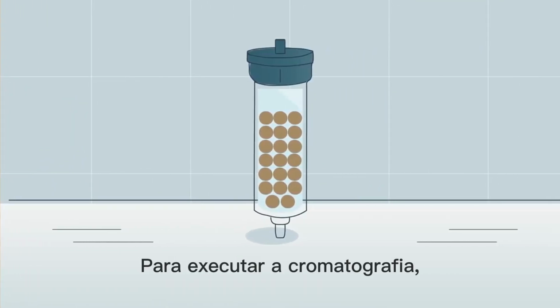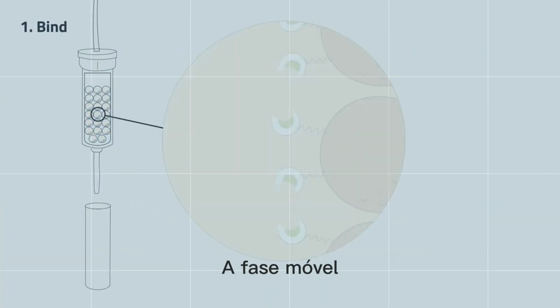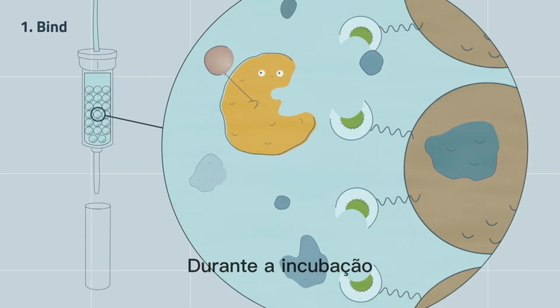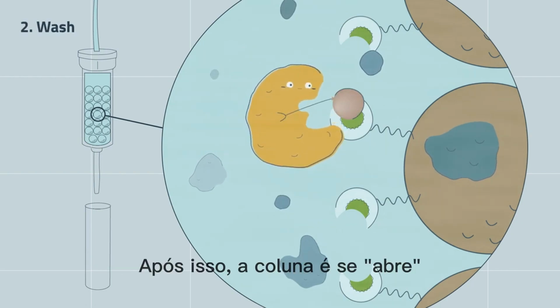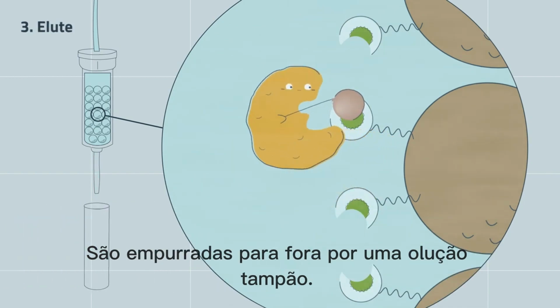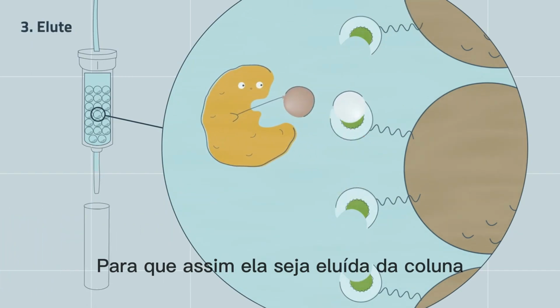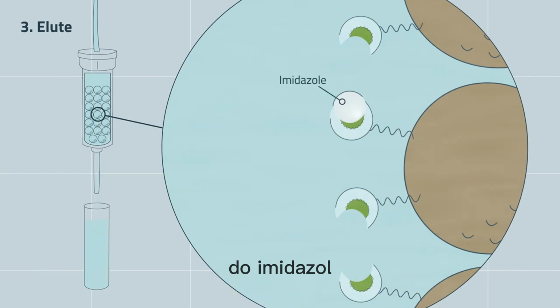To execute the chromatography, the stationary phase can be packed into a column. The mobile phase, containing the His-tagged protein, is added to it. During incubation, the His-tag binds to the NTA metal ion complex. Afterward, the column is opened and all molecules that did not bind to the immobilized ligand are washed away by a buffer. Lastly, the His-tagged protein must be detached from the ligand so that it can be eluted from the column. This is often done via the competitive binding of imidazole.